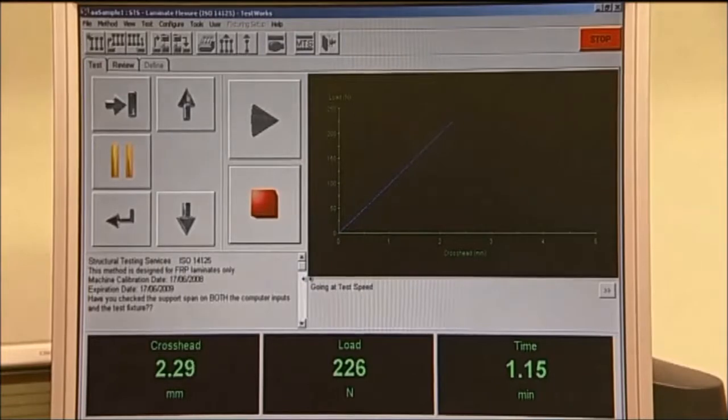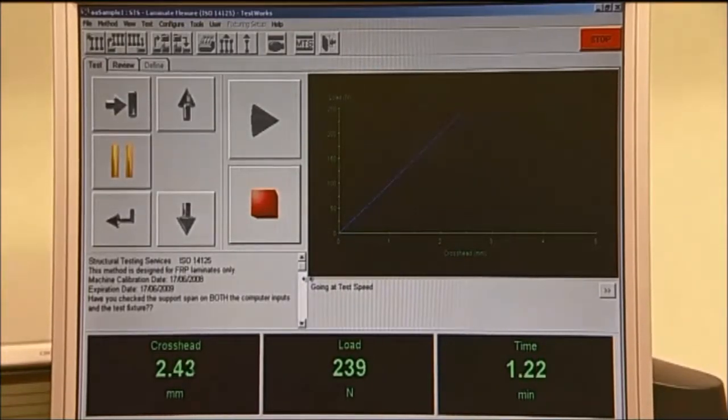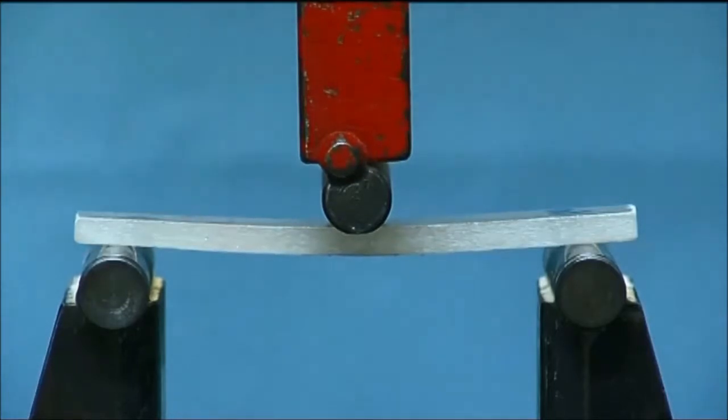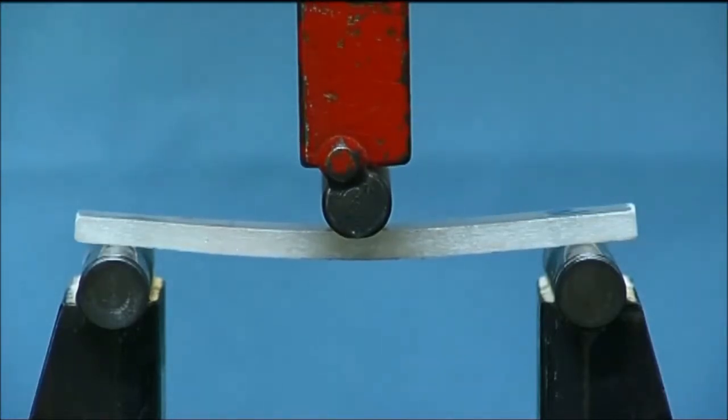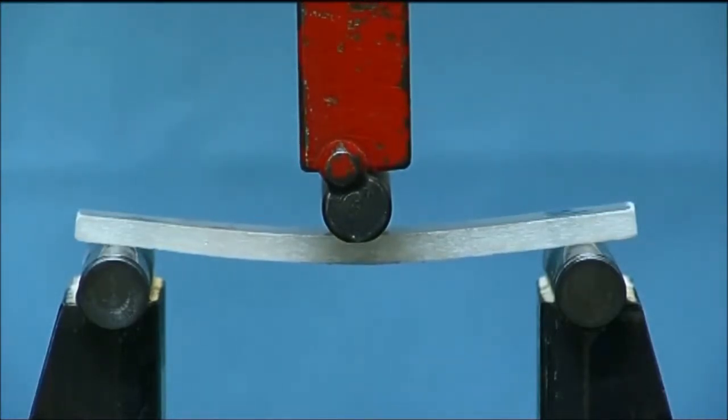The load is then applied at a specified rate until failure by means of a loading nose brought down just above the specimen mid-span between supports, producing three-point bending.